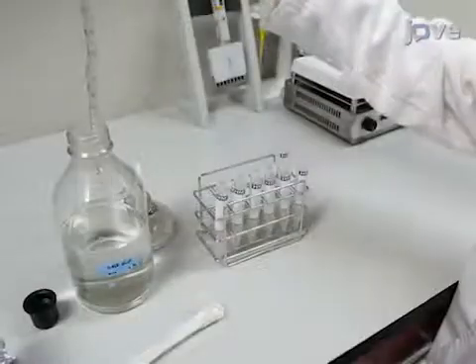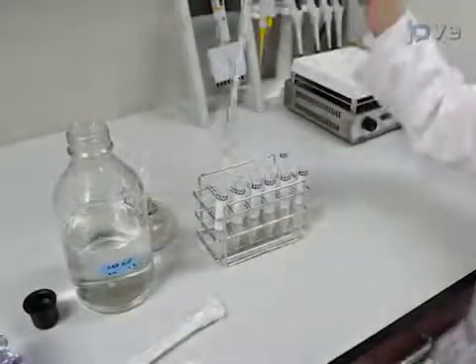In preparation for a serial dilution, aliquot 9 milliliters of the sodium chloride solution.